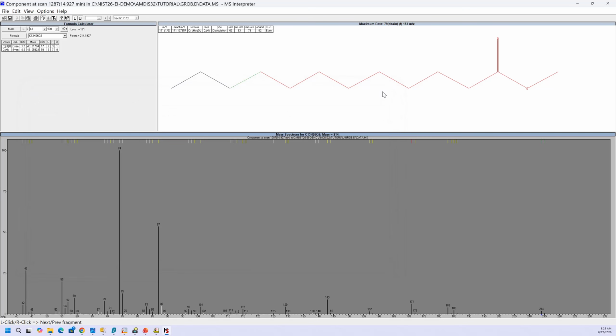And on my website, I have a link in the resources that has a very full explanation of MS Interpreter if you want to take it to another level. So you can take a look at that under the resources on the course. So that's pretty much the basics.